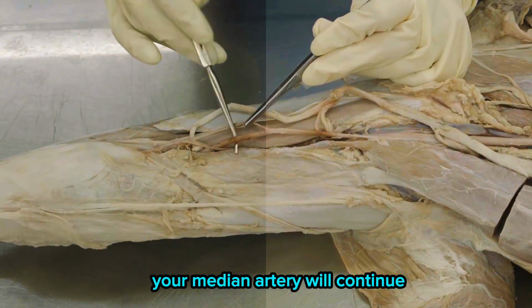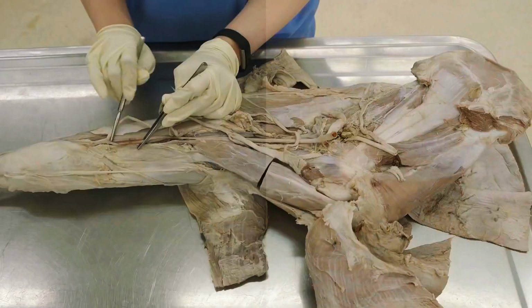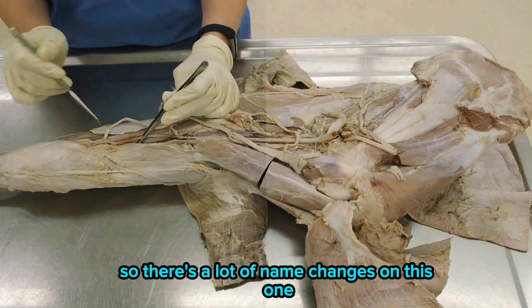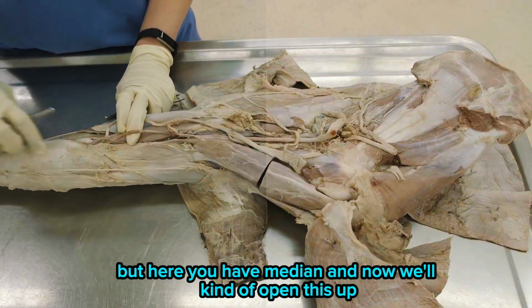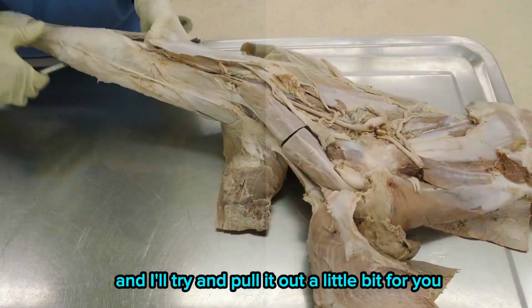Your median artery will continue and actually dive into the carpal canal. Once it enters that carpal canal, it's called the medial palmar artery. So there are a lot of name changes on this one. But here you have the median, and now we'll open this up, and I'll try and pull it out a little bit for you.